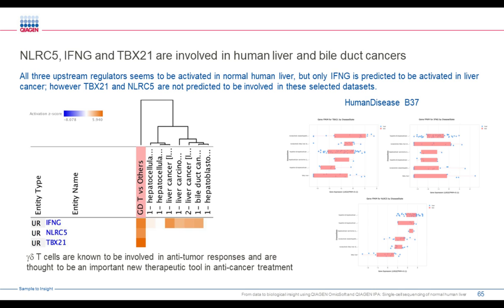So, going from that comparison of upstream regulators from a normal cell type versus other in disease situations, you can also look at the expression of this particular compound in settings that are not relevant to our case here, such as inflammatory disease or other types of injury.